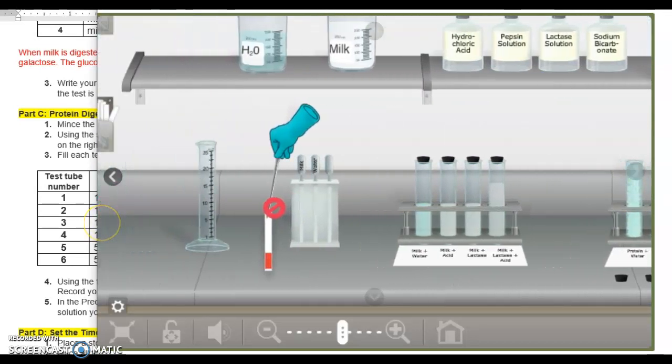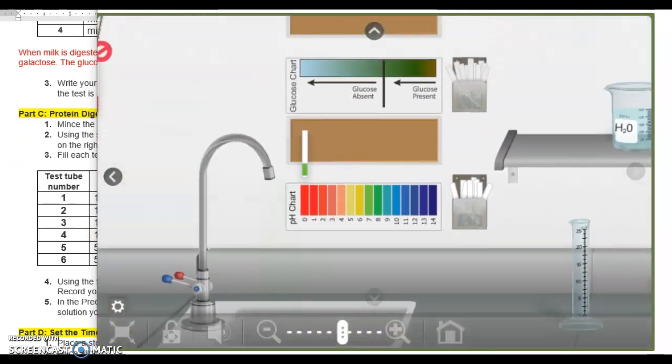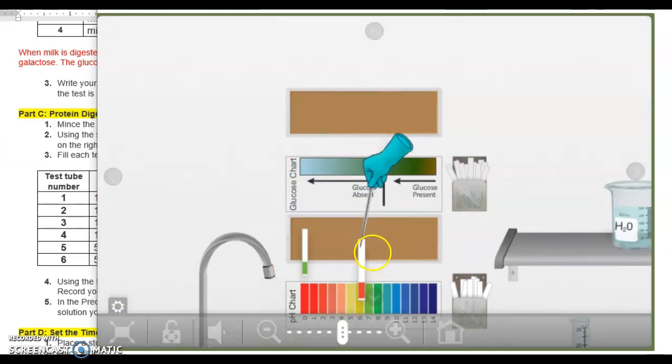So I am going to attach this over here to the board. And I'm going to give myself some space because I have to hang a second one here, and then this is the third one. Pick it up, move it over. And then there'll be 4, 5, and 6. I'm going to pause the video. I'm going to run all the tests for you, and then I will hang them all up, and we'll talk about the results when I come back from the video.